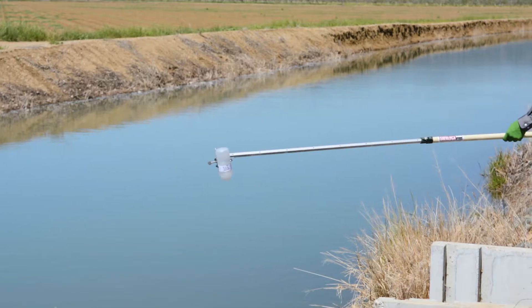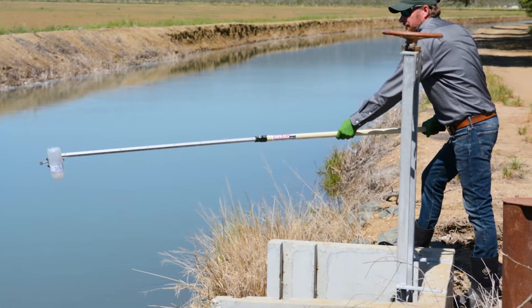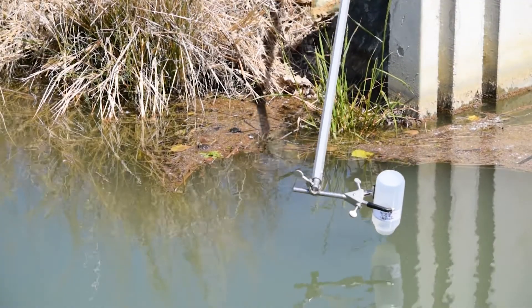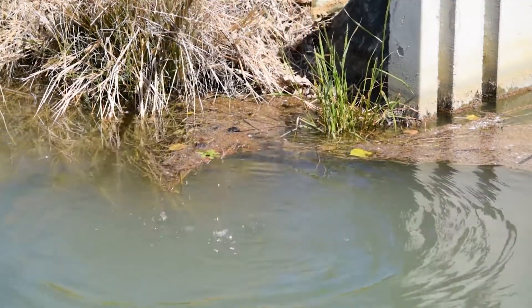The pole should be long enough to allow you to reach away from the edge of the water you are sampling. Hold the open bottle over the flowing water. Quickly submerge the bottle about 5 to 10 inches below the water surface to avoid collecting floating debris. Collect the sample against the current using an arc motion without disturbing the sediment on the bottom or sides of the canal.